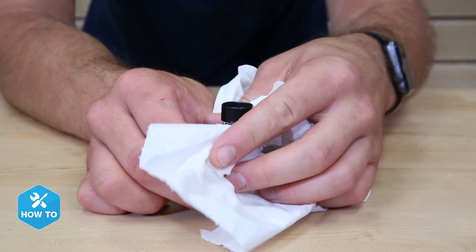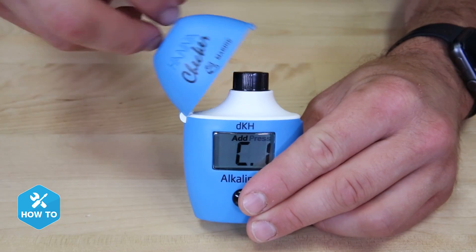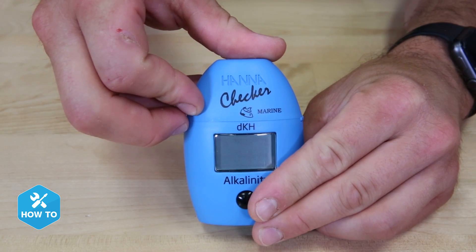After the vial is filled, capped, and thoroughly cleaned, I'll turn the checker on and add the cuvette in when the screen reads C1, close the lid, and push the button, which will zero the meter.